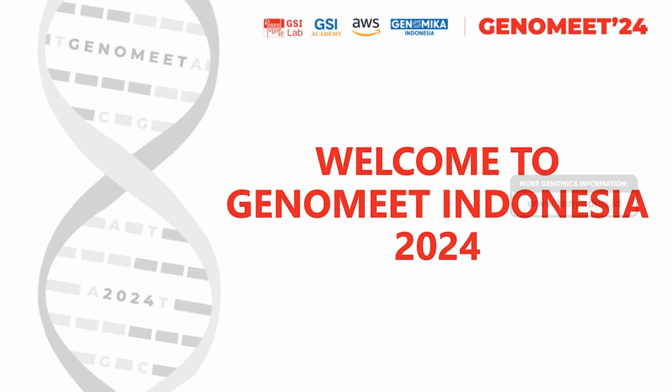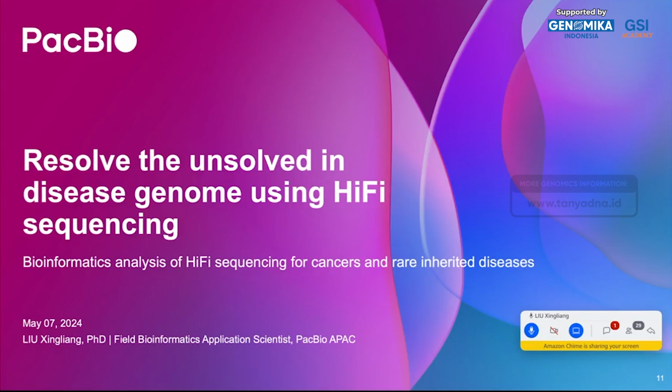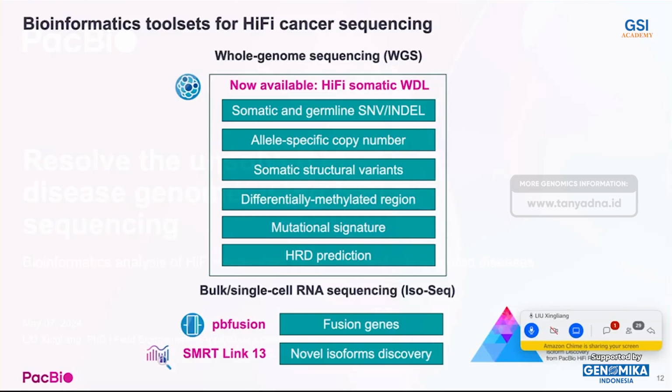So as you all know, using PacBio HiFi long-read sequencing, we could resolve a lot of unresolved questions in disease genomes. So in this talk, I will focus on the bioinformatics analysis for cancer and rare inherited disease studies using HiFi sequencing technology. First I will talk about the cancer study.